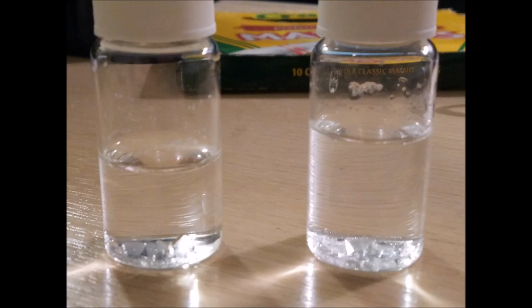There are many different environmental factors which could have affected the growth of these crystals, the main one being the random increase in temperature. This could have increased the rate of evaporation, increasing the rate of growth. Another possible effect could be increase or decrease in humidity.